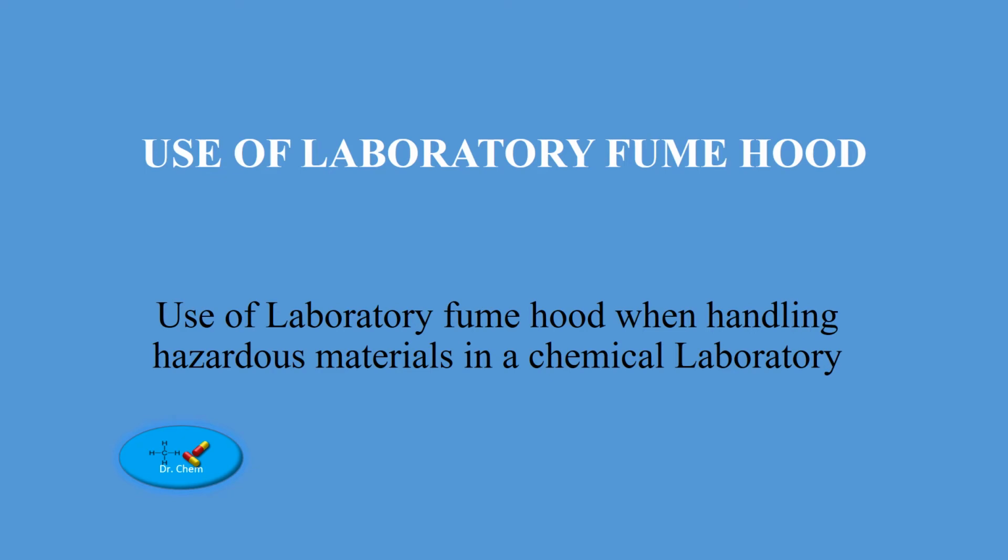It is a requirement for any chemical laboratory to have a laboratory fume hood, fume chamber, fume cupboard, as you may call it. Today we are going to discuss the use of a laboratory fume hood when handling hazardous material in a chemical laboratory.